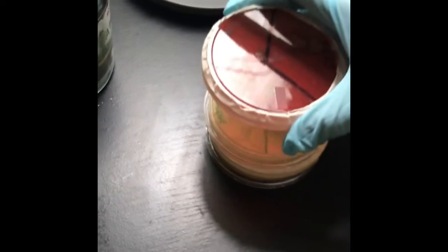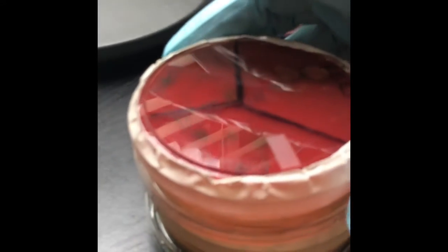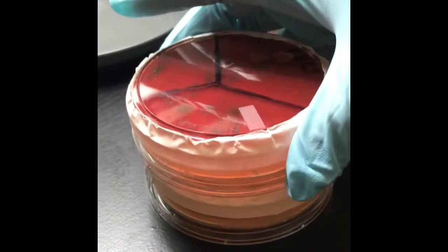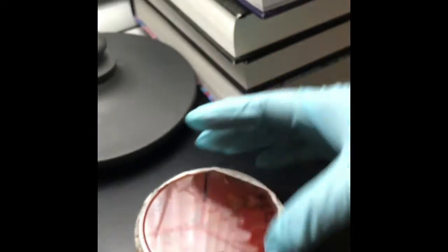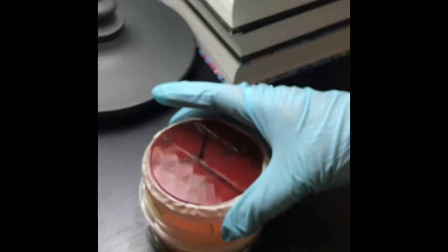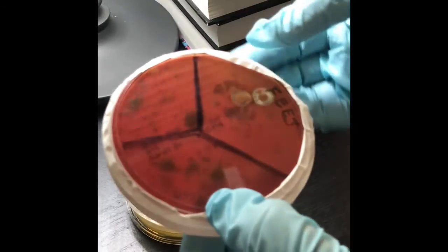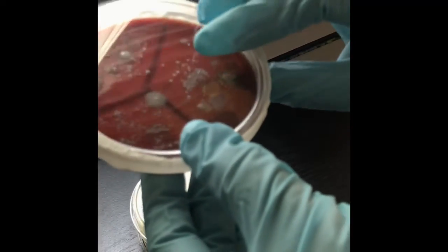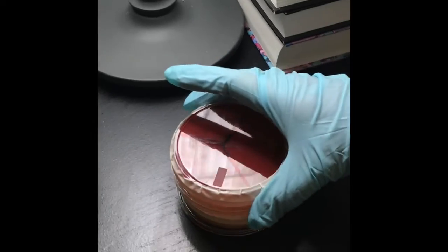So that's it. But I want to show you one more time that we always keep the plates inverted. The reason is that, as I told you in my earlier video, when they are kept in the incubator, they are at a warmer temperature, 37 degrees centigrade. Then when we put them in the fridge and store them, by condensation the droplets of water will fall. If it is like this, the water will fall on the colonies and the colonies will be messed up. So we always keep the agar plates in inverted position.